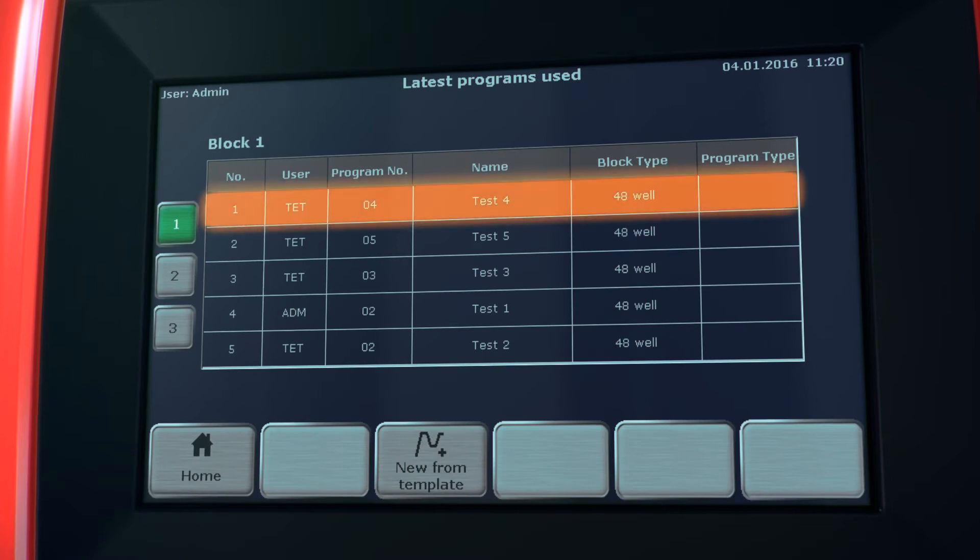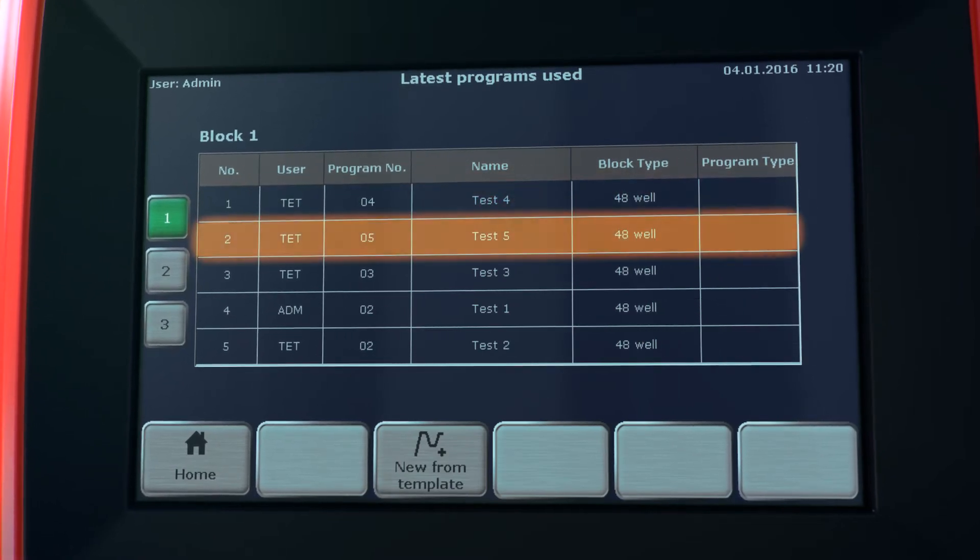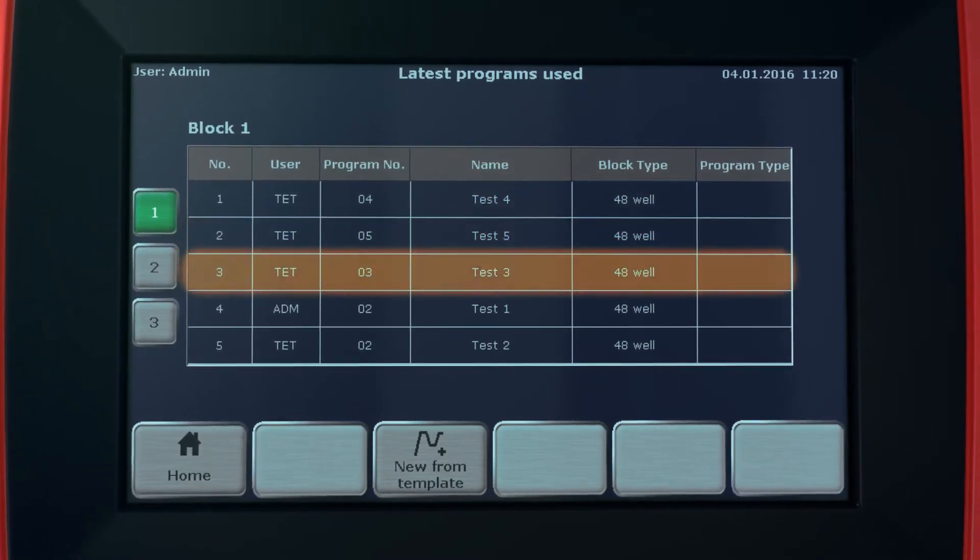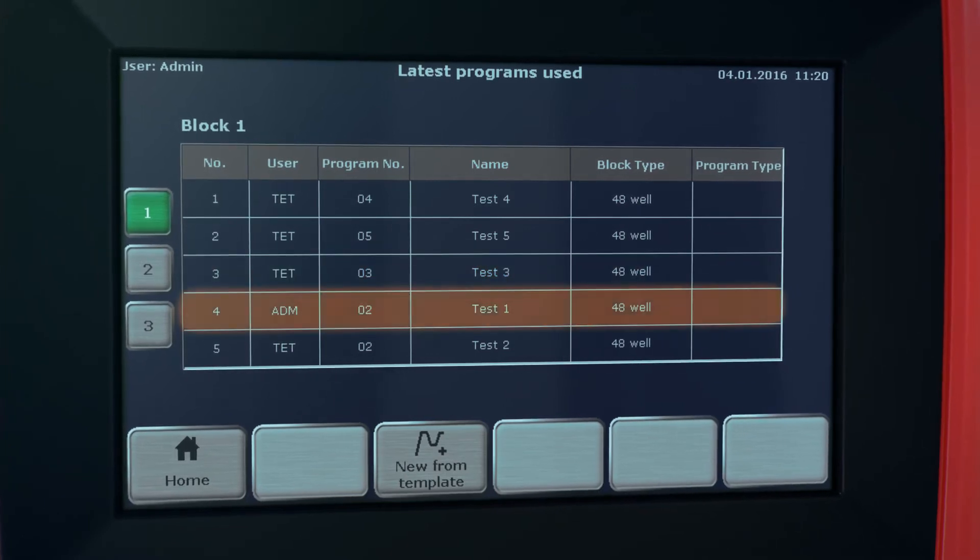For maximum ease of use, the Biometra T-Advanced Thermal Cycler offers a user-specific quick start. The system stores the latest used or edited programs for each user individually.